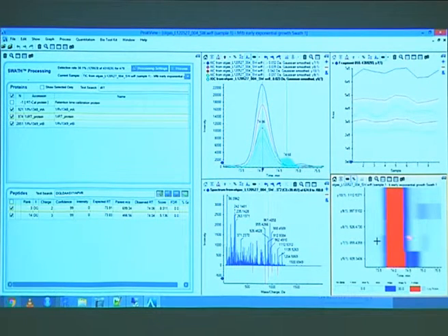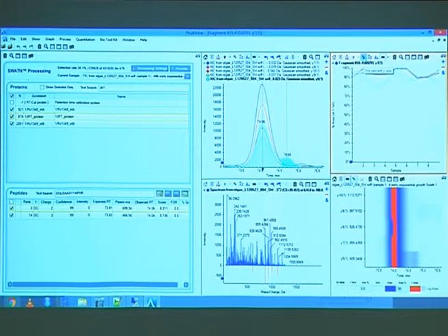Ideally, it looks like this, where you only have one line there. You can modify the color here a bit and say we want 90%, and now you see this is really the only thing there. So this is the way that it should look. It's a nice looking peak. You can do the same thing for the absolute one here as well.